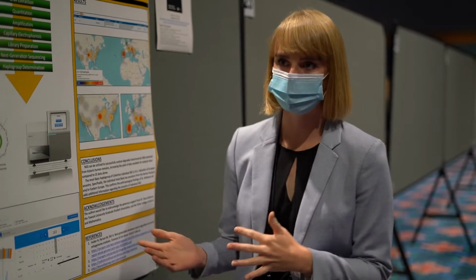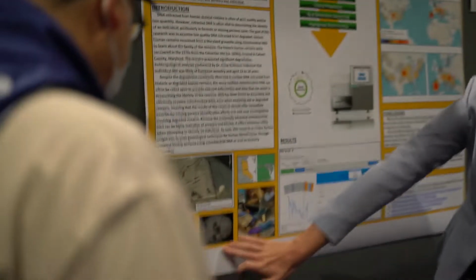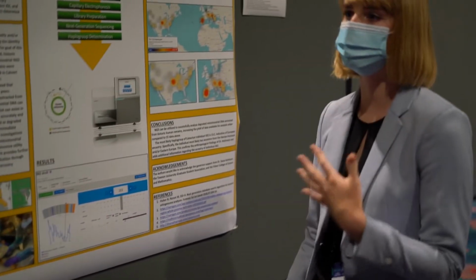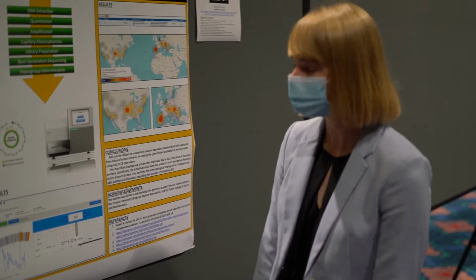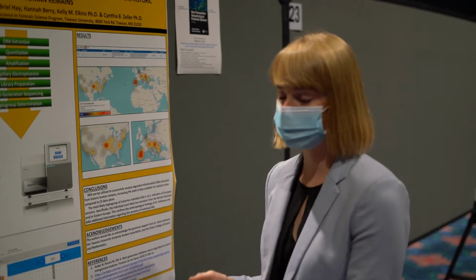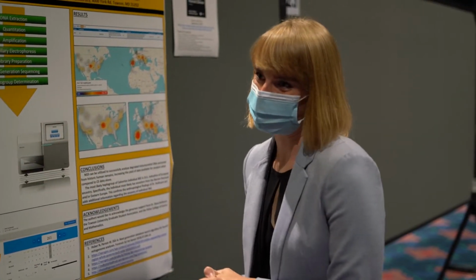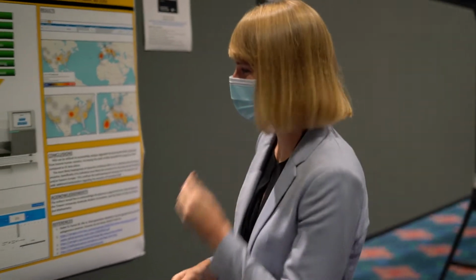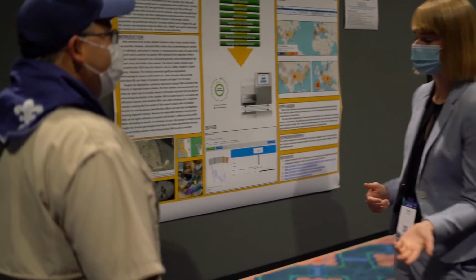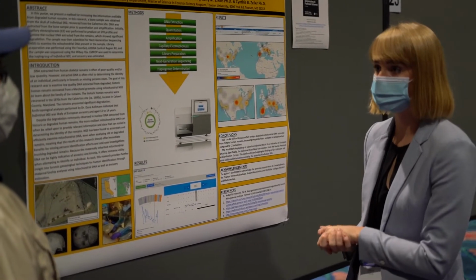So we decided to do mitochondrial DNA, and my research focused on one person who was a 12 to 14-year-old child. Oh. And I just wanted to see what their haplogroup was, try to learn a little bit more about their story. So we did mitochondrial DNA sequencing using Verogen's MiSeq FGx system, which is beautiful. We have a brand new one in our lab. Oh, it's awesome. Congratulations. Thank you. So we did this whole experiment from DNA extraction all the way through library prep, and then I used EMPOP to figure out the person's haplogroup.